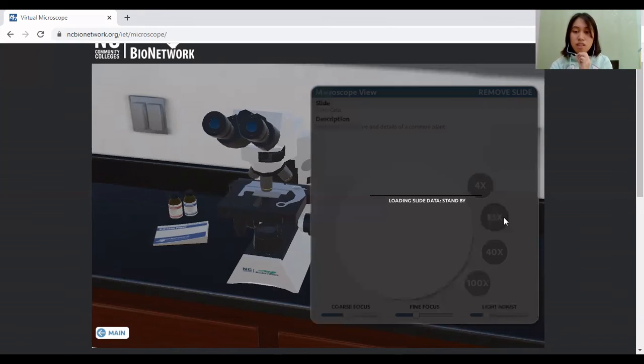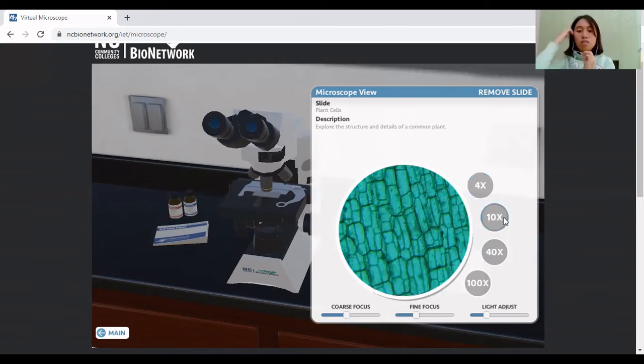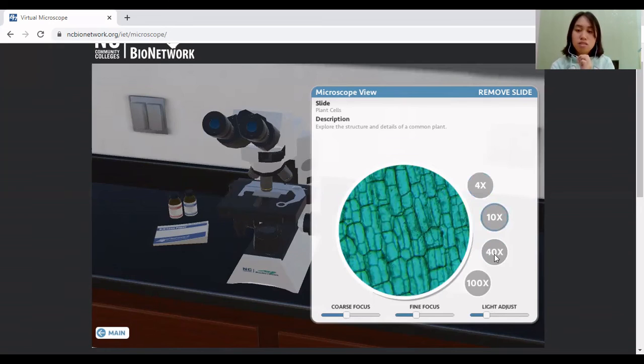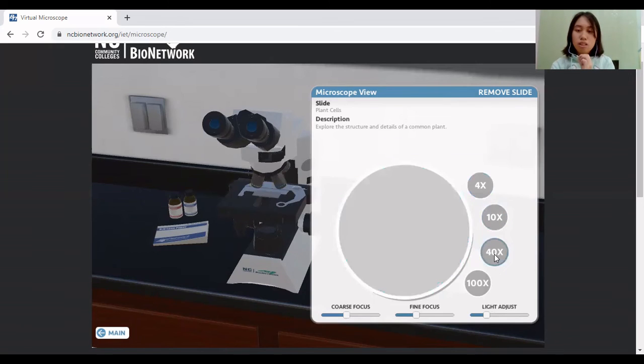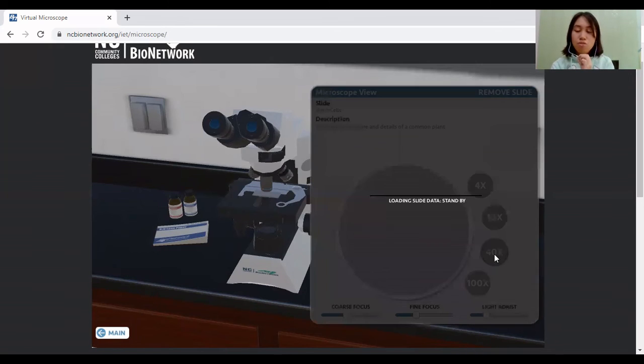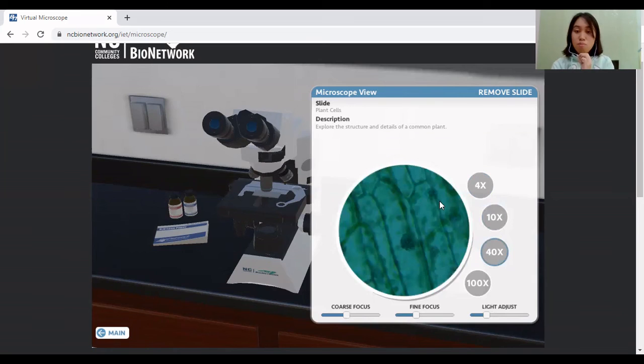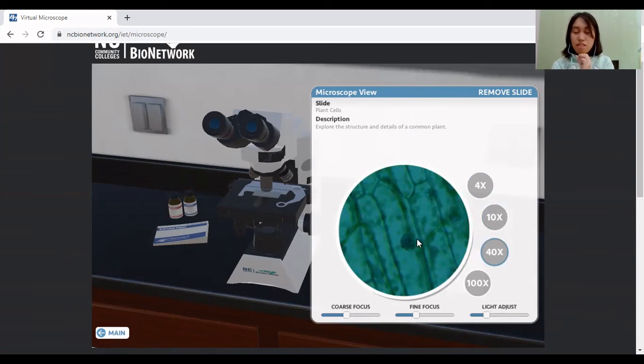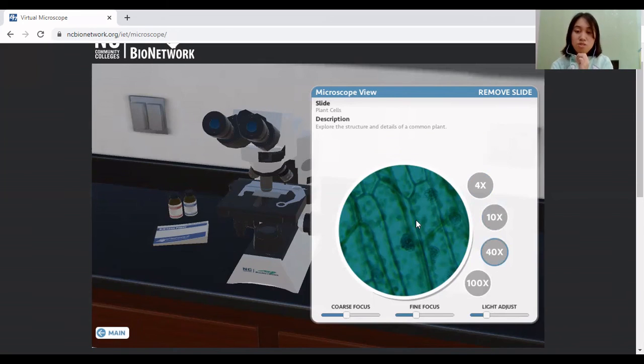For 10x, it will look like this. And for 40x, 40 times closer. It's a more closer view of the cell. So you will see the little components on what the cell composes at the same time.